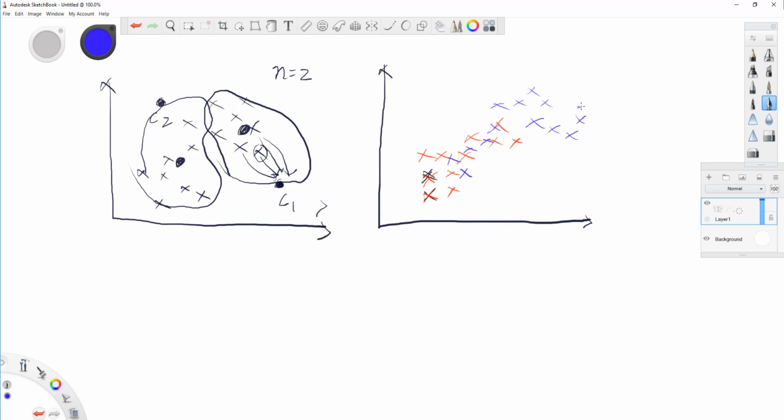Okay, so what I'm trying to say here is k-means has some limitations because it's a hard assignment of either C1 or C2 in this example. But what if clusters overlap, for example? How do we deal with some of these? So apparently it looks like Gaussian mixture model works very well in these types of scenarios.